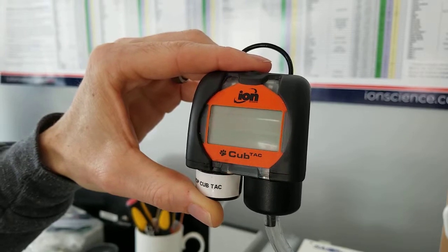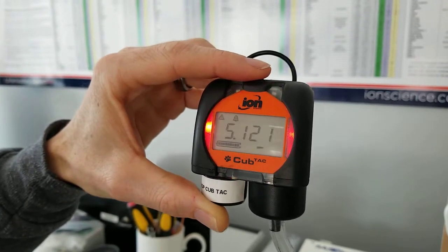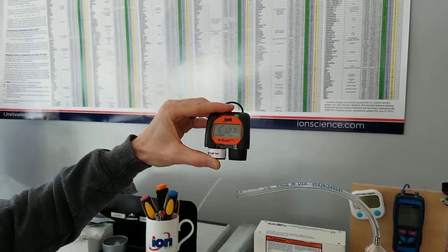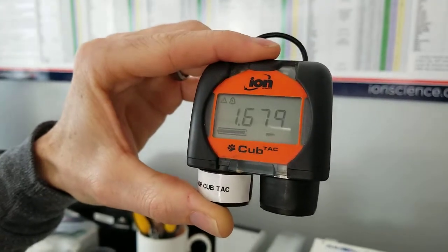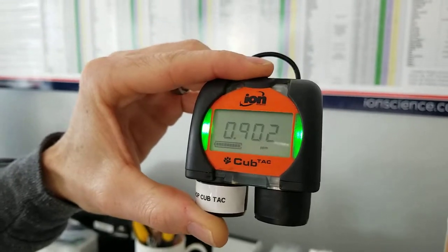Here's a bump test reading — just a little over 5 ppm, so we're on the safe side. We turn off the cal gas and remove the gas from the instrument, then remove the calibration cup. We see the reading dropping nicely, and we are happy with our calibration.